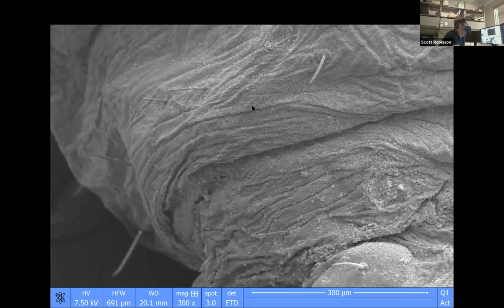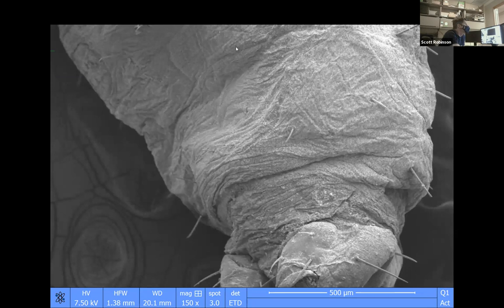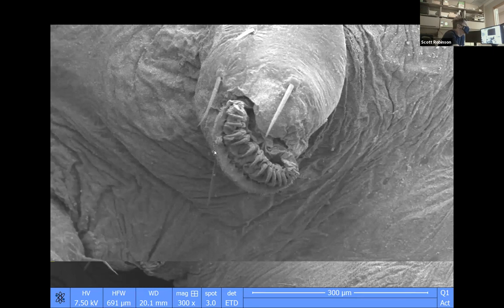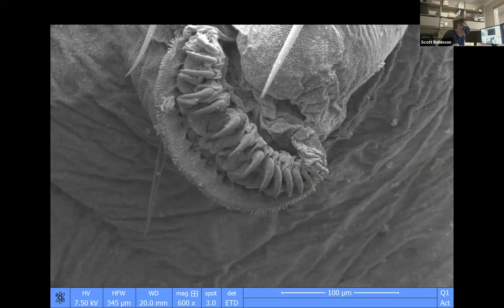You can see what the cuticle looks like. It has these very, very small features. You can see that it's shrunken a little bit. And now we can see the prolegs with the little crochets. Kind of creepy looking. It functions like the hooked part of a Velcro to grab things. Yeah, isn't that neat? Really, really wild.